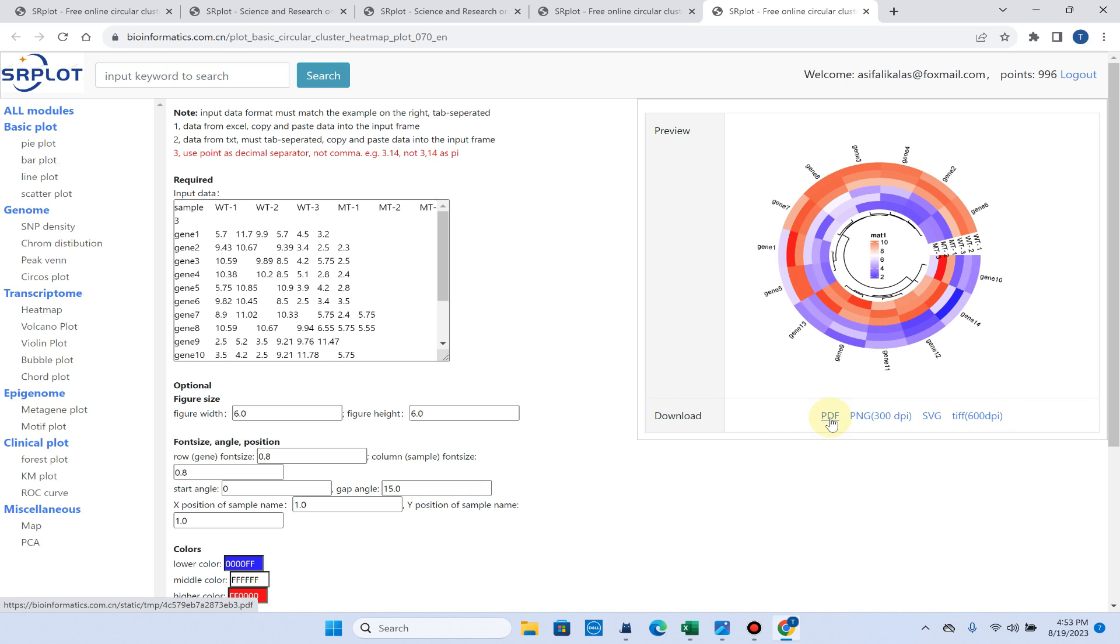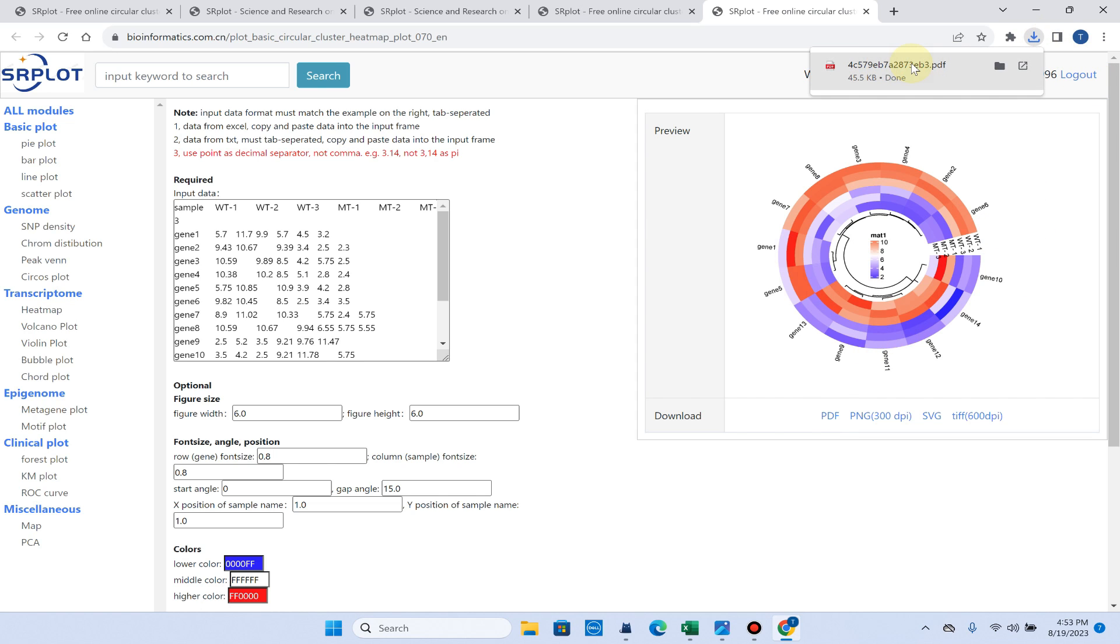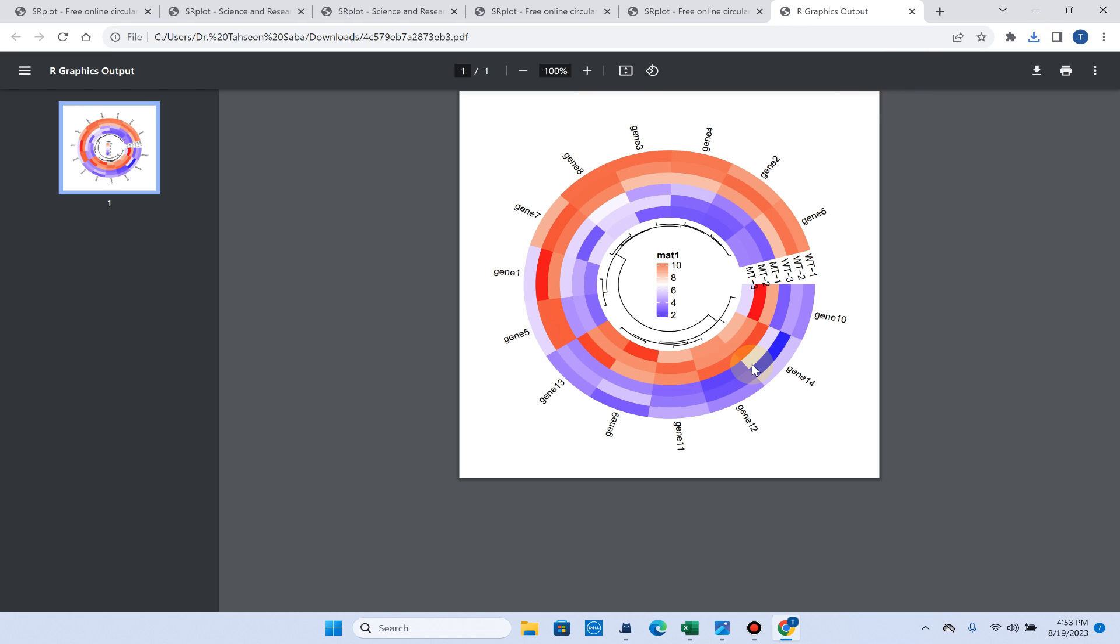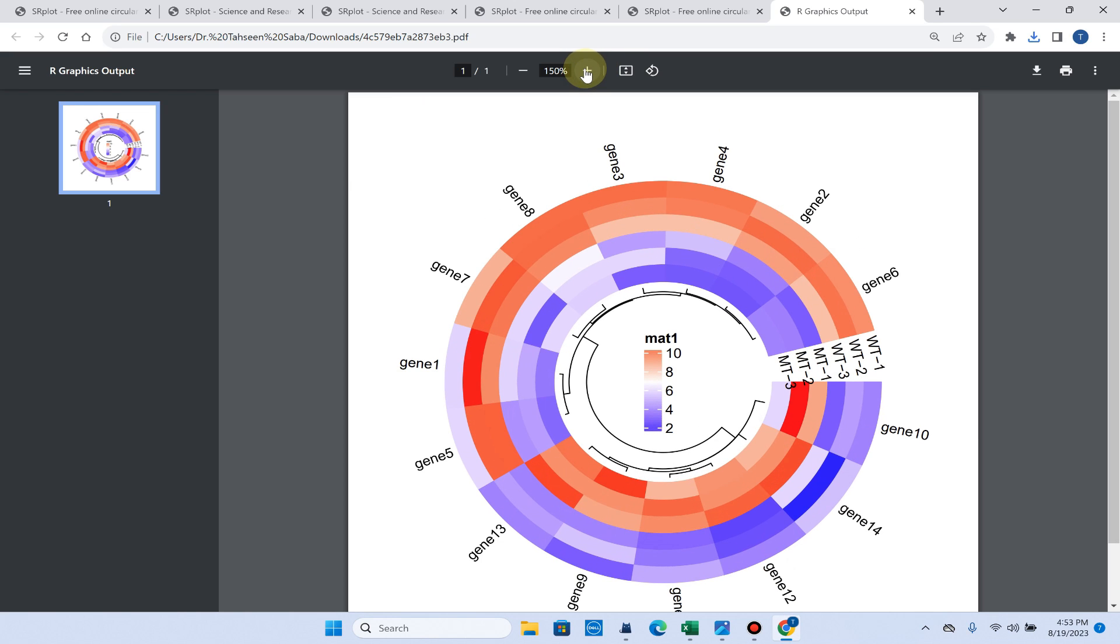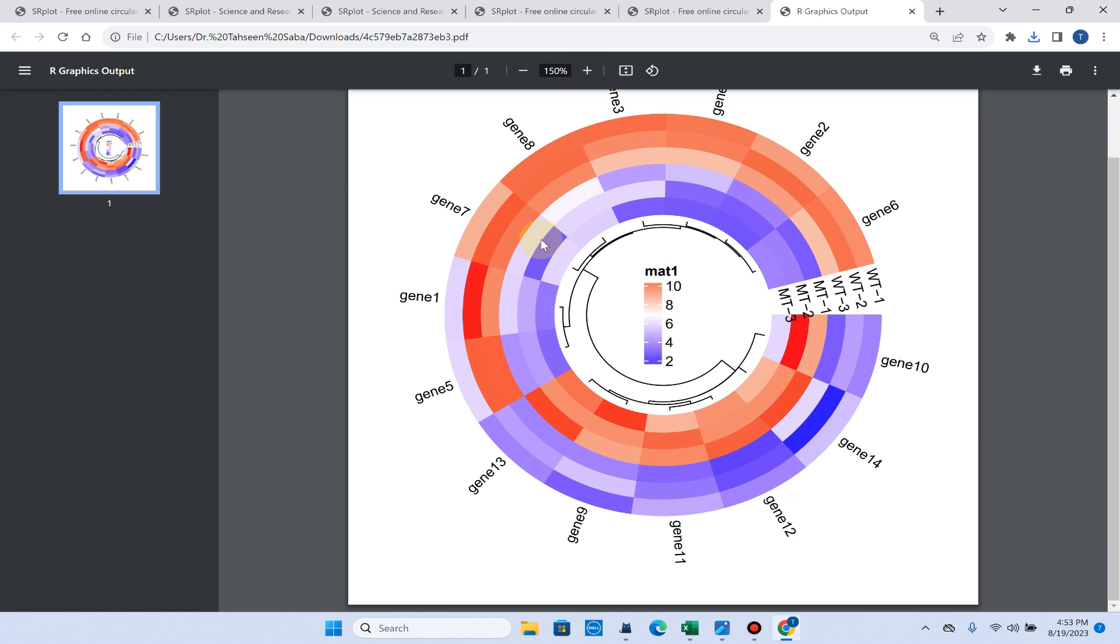Let me download it in PDF format. Here you can see our PDF has been downloaded and this figure is of high quality and you can directly use it in a research article.